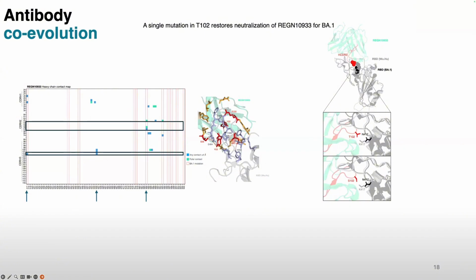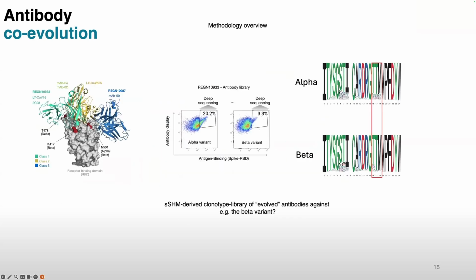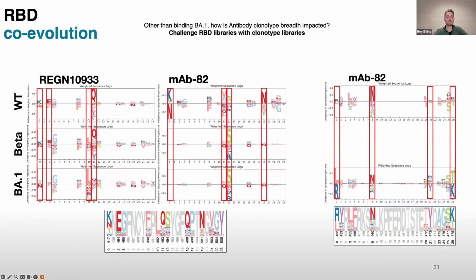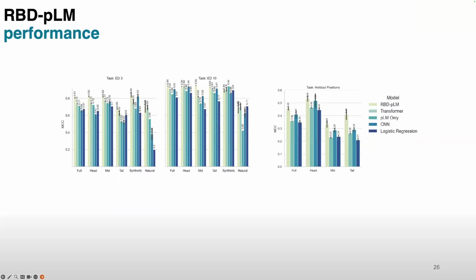What I was wondering is, when you screen your optimized library, I can't remember the name of it, then with a... You mean given the in silico library? RBD, and you get out binders from your sorting. I was just wondering, you make the Fab and you do affinity analyses. Okay, so the antibodies themselves. So SPR or something like that? What kind of numbers are you getting for affinities?